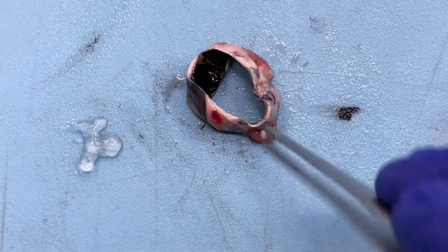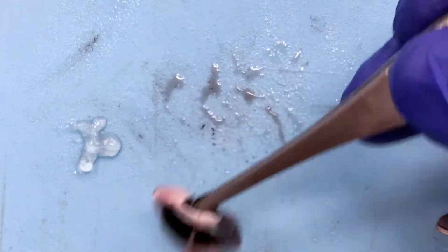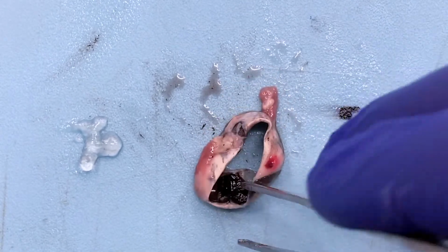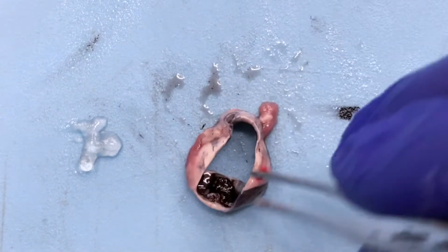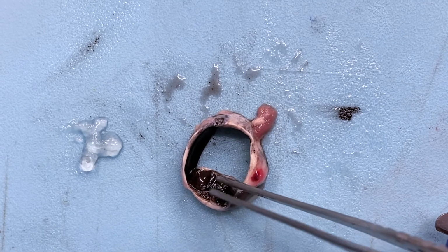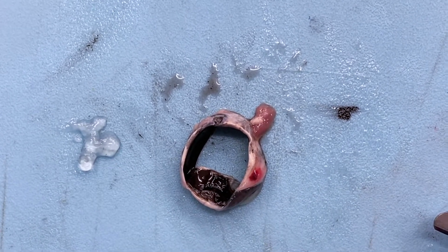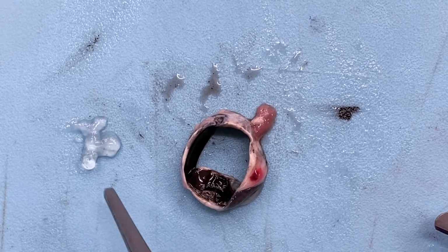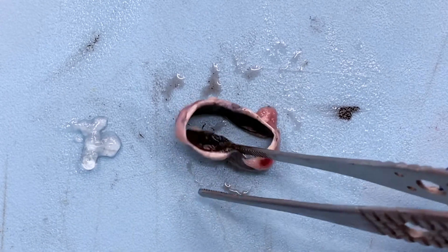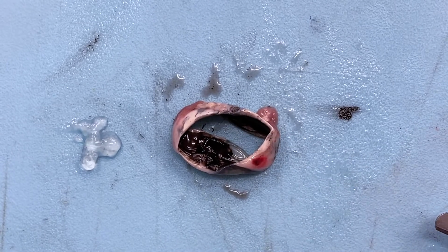Now ideally, my tumor, which should be indicated with some inking, which might have gotten lost, is going to be located somewhere on the retina there. So all this black stuff on the inside is our retina. Our lens would have been right here. Now you can see part of it, so I'm going to try to include that in our cassette. You can see it did not save very well. But we have retina and sclera, and we can't really see the choroid, which is that middle layer.